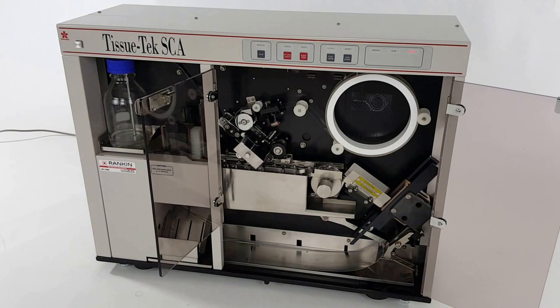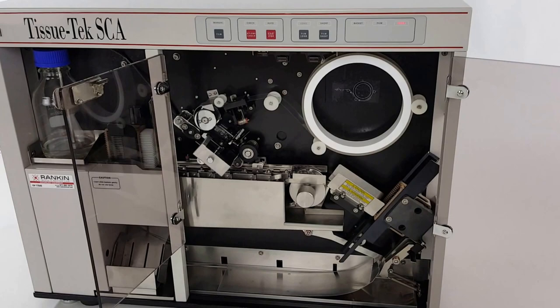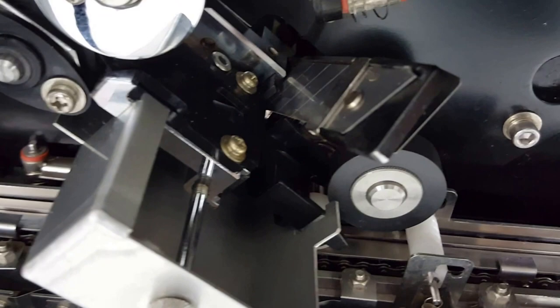This is a Sakura SCA 4764 film cover slipper, and we just got done remanufacturing it. I just wanted to give you guys a brief overview. It's a film cover slipper, and there is a diagram right here that shows you how to load it properly.